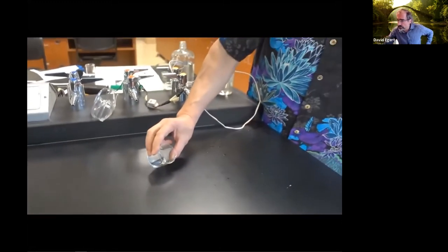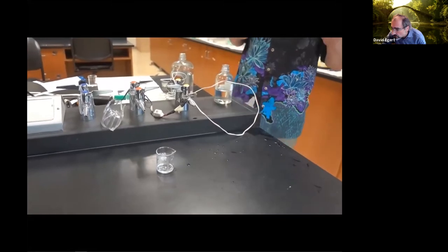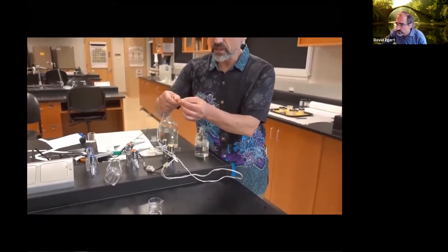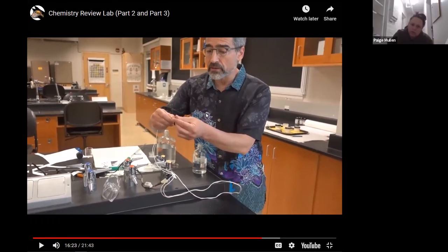I don't know if it's possible. Does that show up there? And then I can check the electrical continuity. Again, I take my wires and I'm holding them parallel. What are you going to expect? We have salt in oil. Are we going to expect it to conduct electricity or not? No. Why is that?